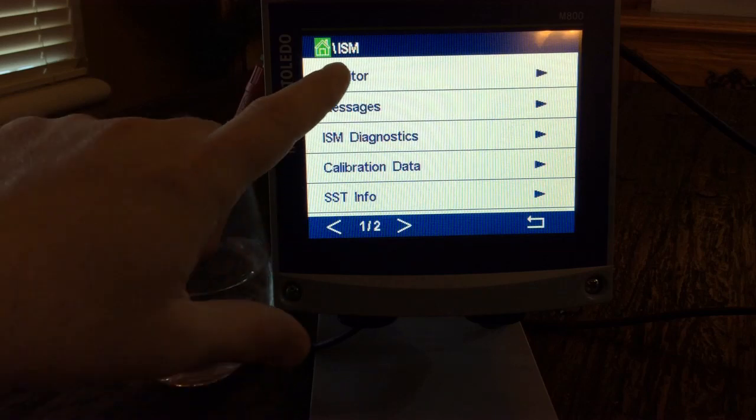With these digital sensors, the pH sensor I have hooked up gives us a lot of helpful information. DLI is Dynamic Lifetime Indicator — it's telling me this sensor has 380 days. TTM is Time to Maintenance — I have 30 days left. The Adaptive Calibration Timer stands at 14 days. This sensor will tell me when I need to calibrate and when I need to clean, and every time you calibrate it, those things will adjust.